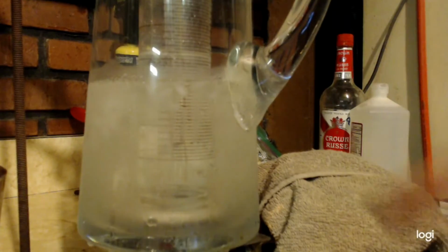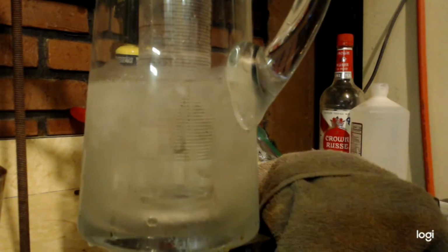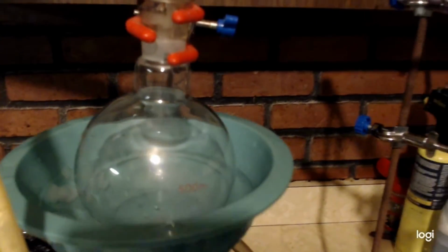Starting to reflux, but you can see it's bubbling now. It's getting soapy. Yeah, it stopped bubbling. You can see it's just bouncing back and forth right here. But it is starting to distill. And the soap bubbles are kind of staying in the pot. So far so good.